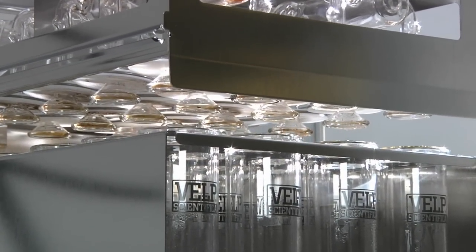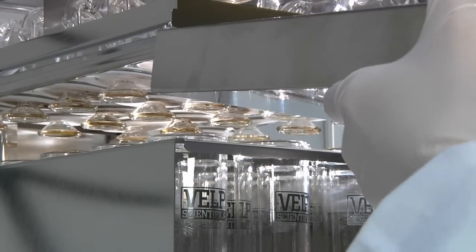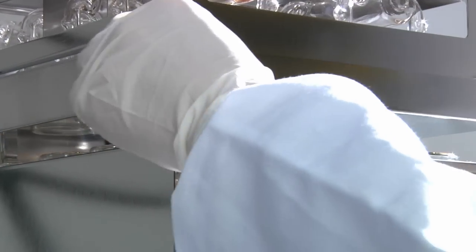It is then possible to slide the rack out and replace it with another in order to start the next run, increasing productivity.